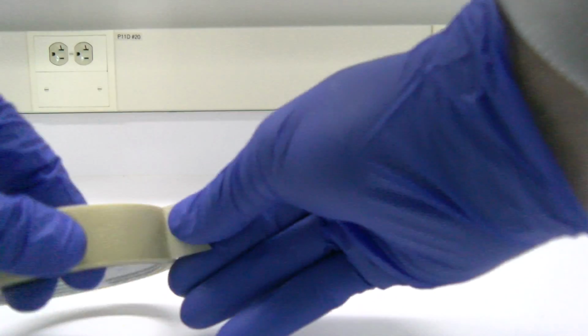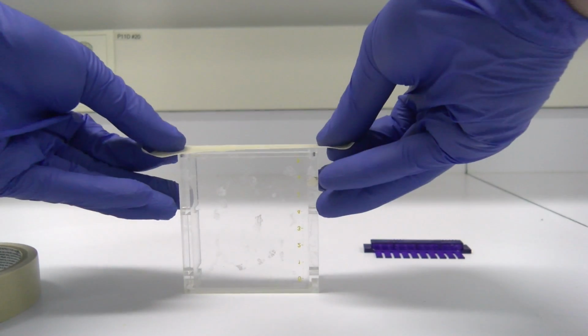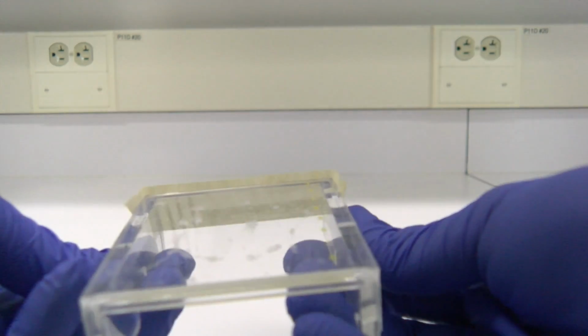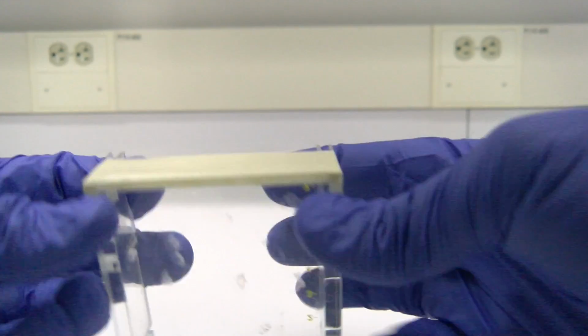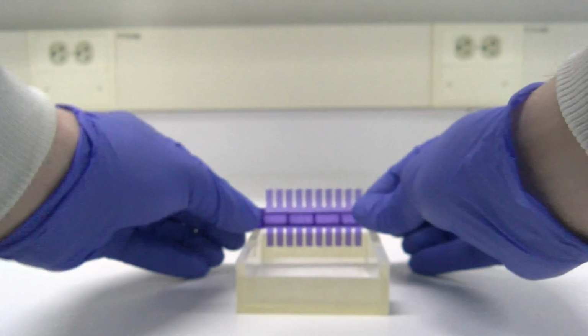Since we will only be extracting a few samples, we will use this small cassette, which should only need about 50 milliliters of gel solution. To get our cassette ready for the gel, we must tape both sides and then place our comb in the top. Make sure to tape it like this, leaving a little bit of tape over each edge so that it will stick to the bottom of the other side, ensuring that nothing leaks out while you are waiting for your agarose gel to solidify.